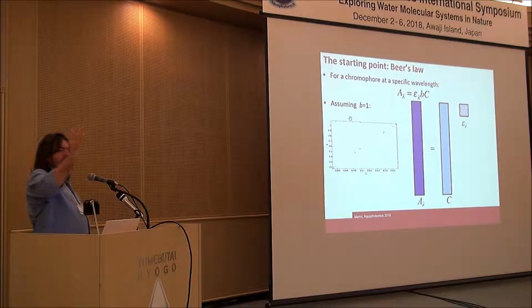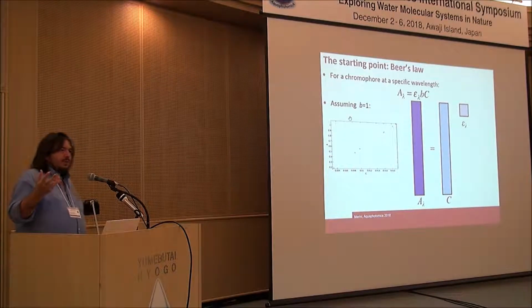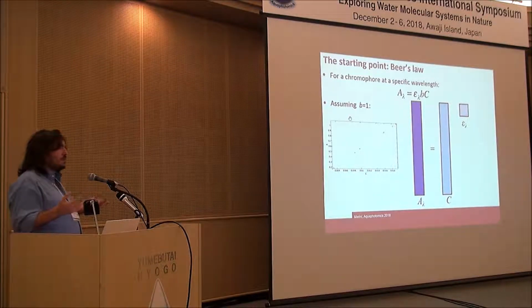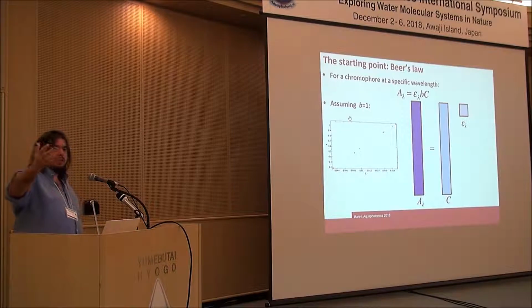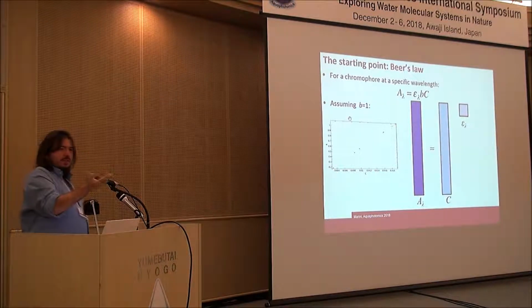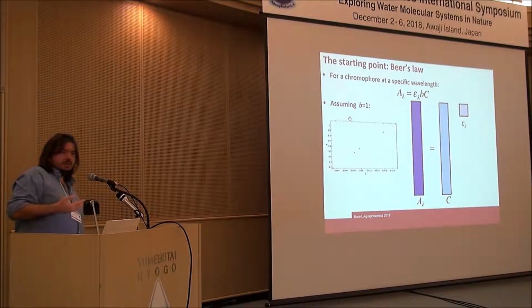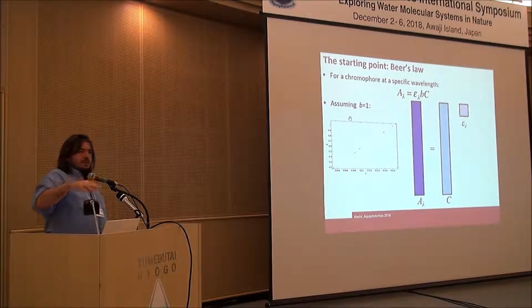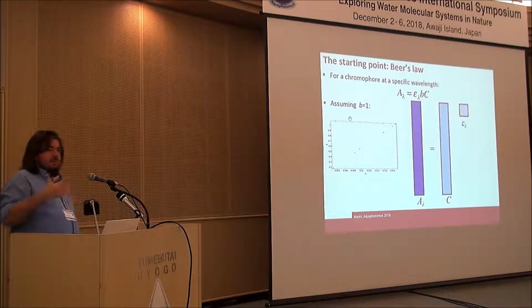So if you think about the knowledge that you may have about principal component analysis, then thinking about MCR, or multivariate curve resolution, is thinking of another way of doing a similar decomposition of the data into a set of meaningful profiles that, for instance, can be used to describe the main phenomena occurring across the samples, and maybe to extract loadings that can be used, for instance, to define water patterns or water absorption patterns.